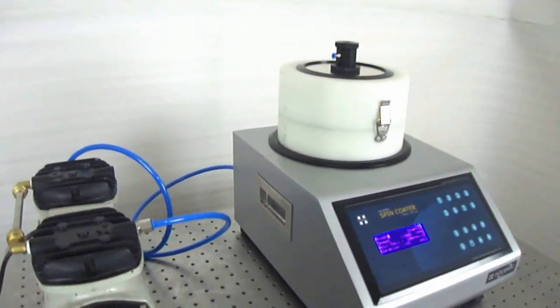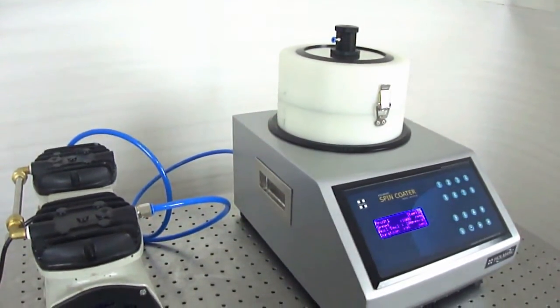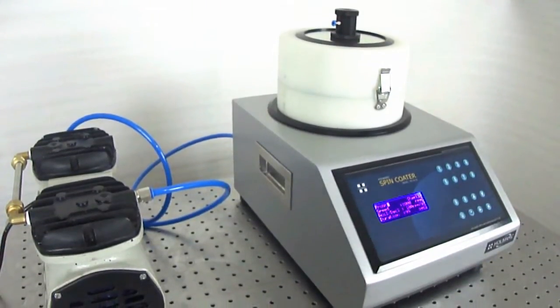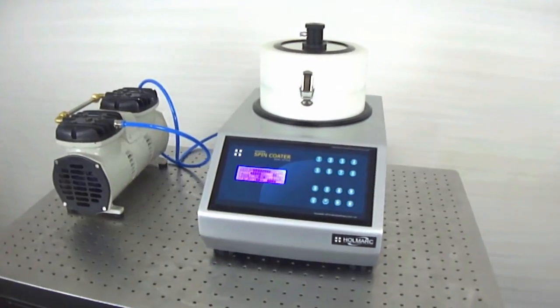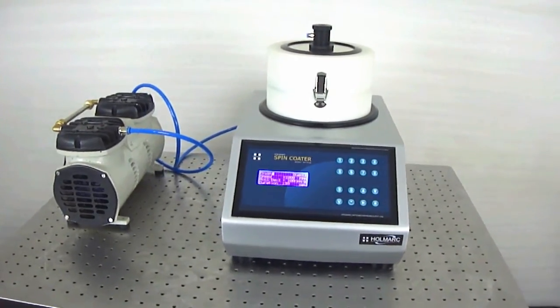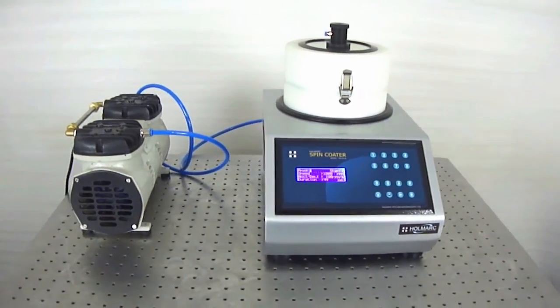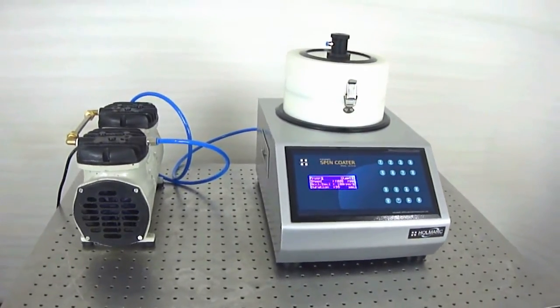HomeArcs Spin Coating Unit is a dedicated tabletop device to spin coat small substrates up to 100 mm in diameter. The device is compact with all electronics built into a single unit, resulting in minimized footprint.